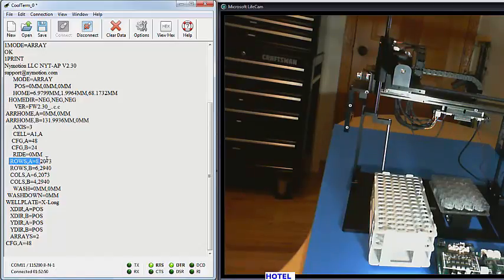And the rows and columns for each: A has 8 rows, and the distance between those rows is 2073 encoder counts. And the columns for A is 6. There are 6 columns with the same number, 2073. And again, those can be different distances. And B is set up the same way. B is 6 rows with 2940 between them, and 4 columns at 2940 between them.